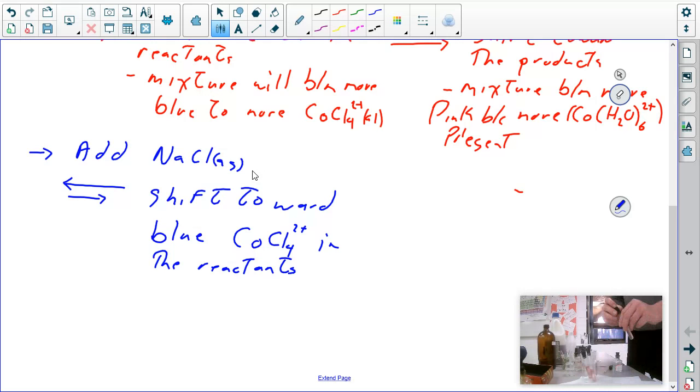The stuff that we're using here is 99% pure alcohol, so I'm hoping Mrs. Fraser doesn't walk in and get the wrong idea.